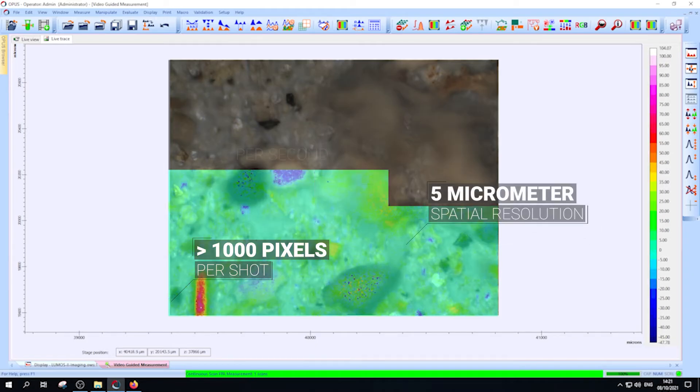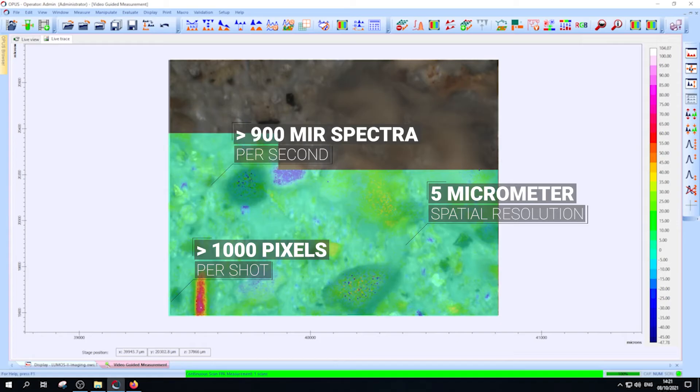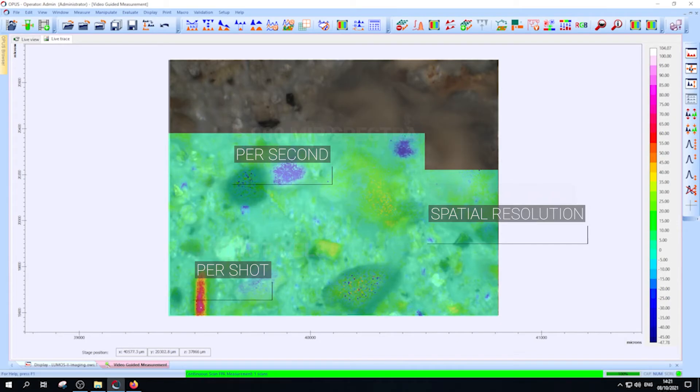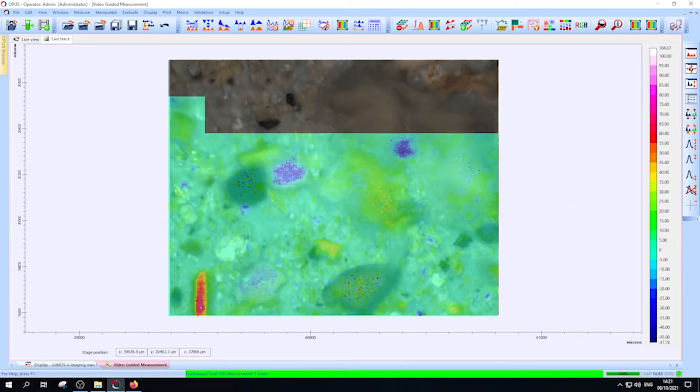We are collecting over 900 full MIR spectra per second, enabling us to get a meaningful and most of all reliable identification result. This shows why FTIR imaging and focal plane array detectors are the gold standard in microplastic analysis.